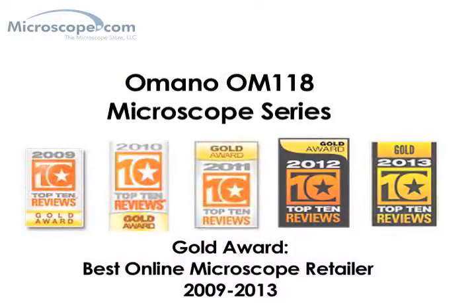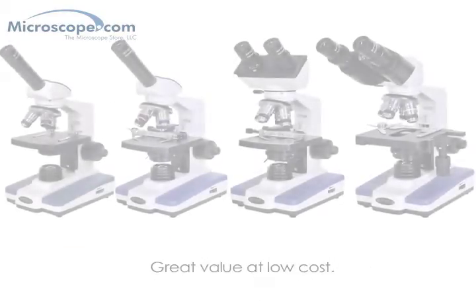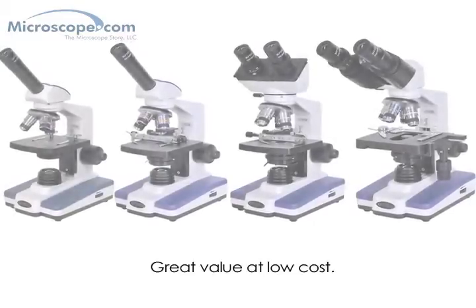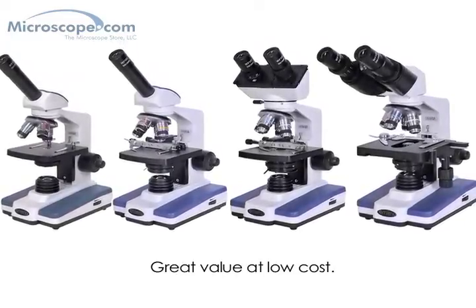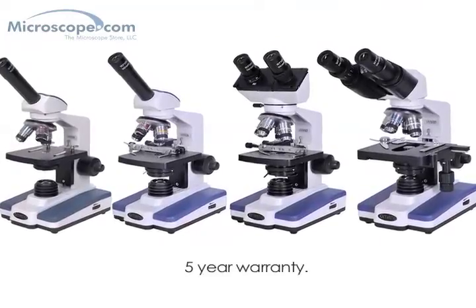The Omano 118 compound microscope series has been one of our top selling compound microscopes since we introduced the line in 2010, and for one simple reason: they represent amazing value. For a minimal investment they give you very decent quality, a lot of bang for the buck, and they carry five-year warranties.